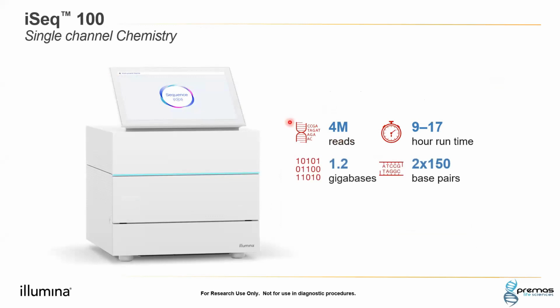Our smallest machine, iSeq 100, uses single channel chemistry. It has only one channel, and it's basically on and off, so 0 and 1 is how it base calls. With this, it offers 1.2 GB of data and 4 million reads. This machine is pretty simple.